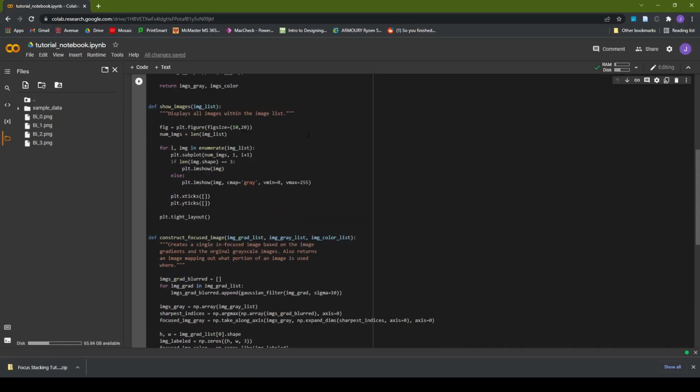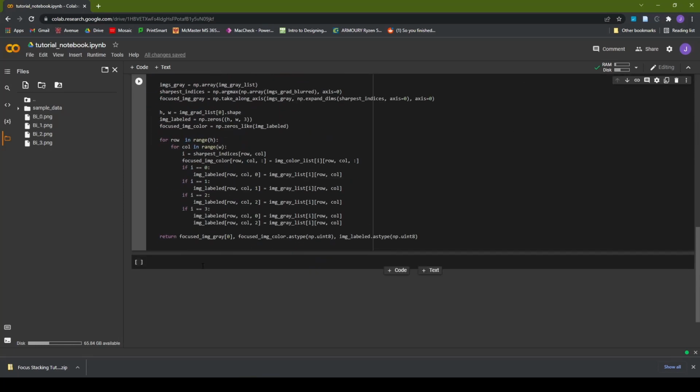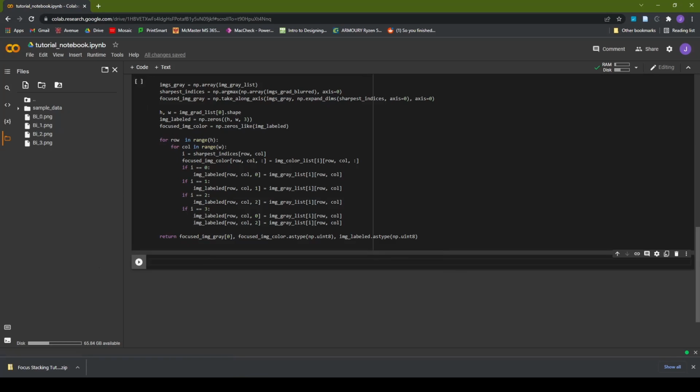And if you'd like, you can click on the images and expand them here to see as you wish. So the first thing that we're going to do to program is just load in our images as these data matrices or data arrays.